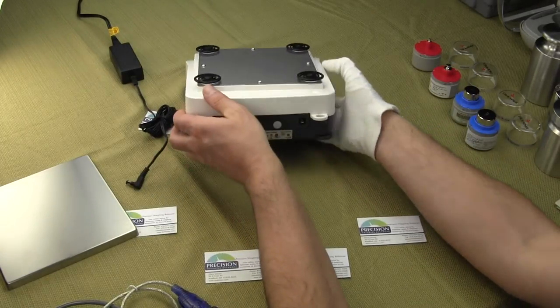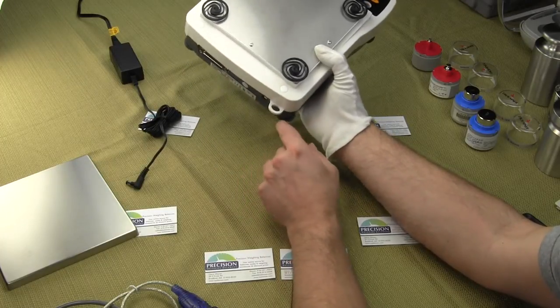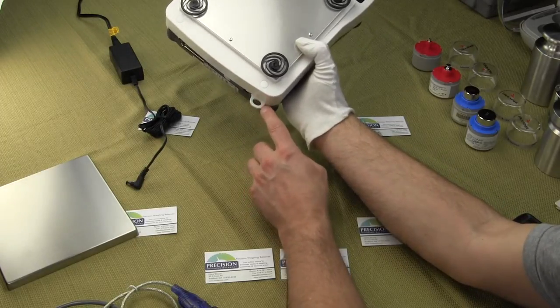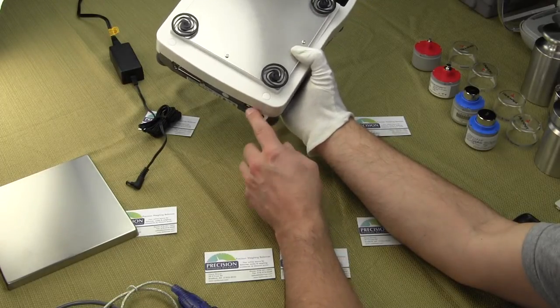Going over a few of the other features with this balance, you'll notice that it has a security hook here. This is for if you wanted to put a cable through the back of the balance to secure the balance. A lot of universities will lock down their balance.